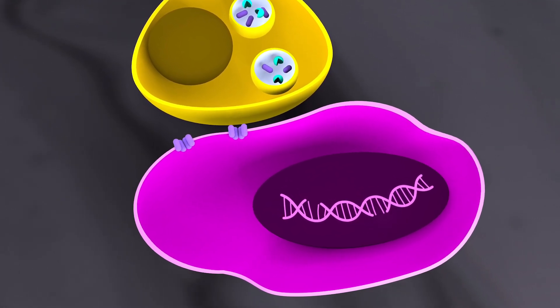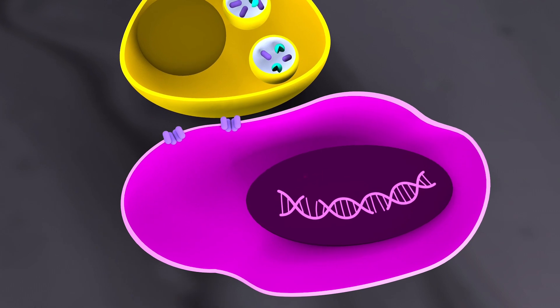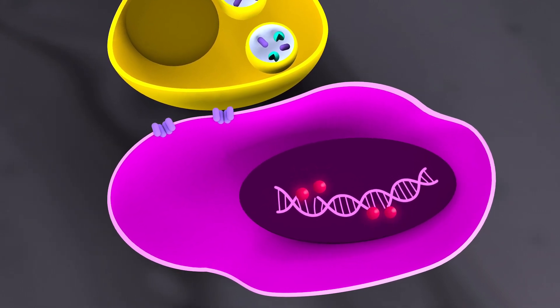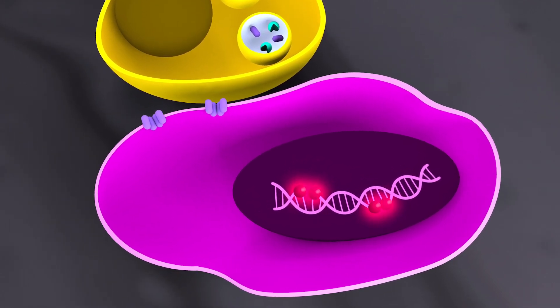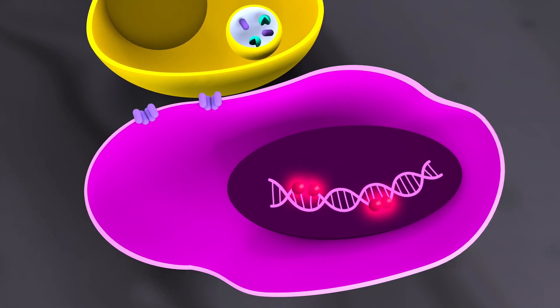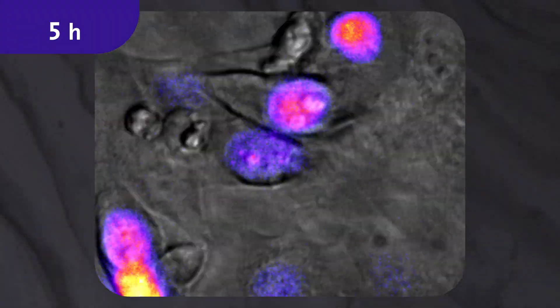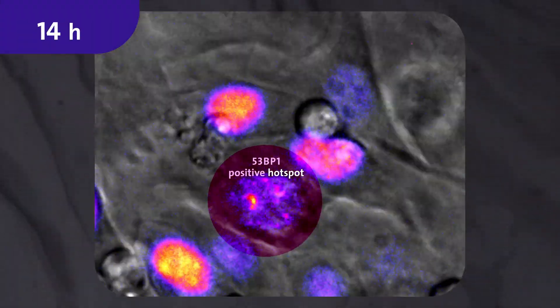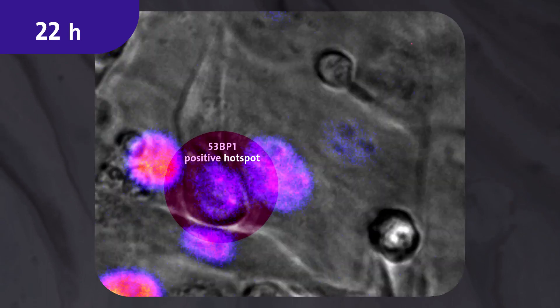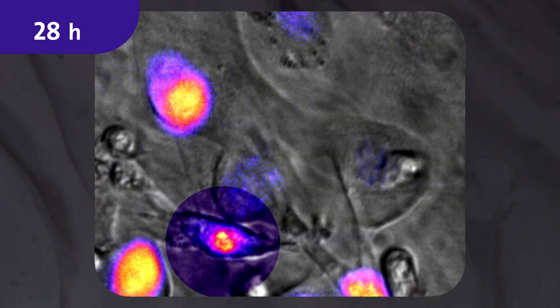The tumor cell counters by attempting to repair the damaged DNA. The DNA repair protein 53BP1 is involved in this. DNA repair zones are then visible as characteristic hotspots. If the damage is great enough, this leads to cell death due to complete fragmentation of the DNA and nucleus, also known as apoptosis.